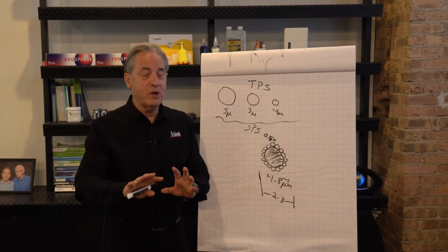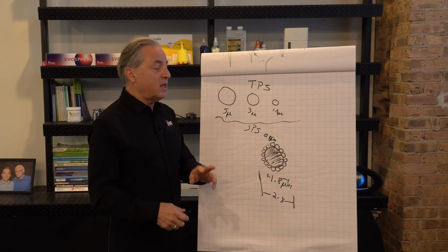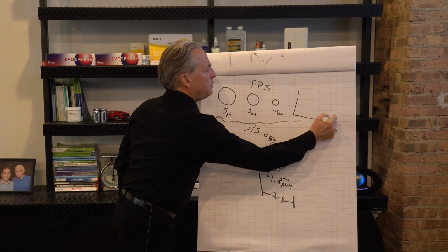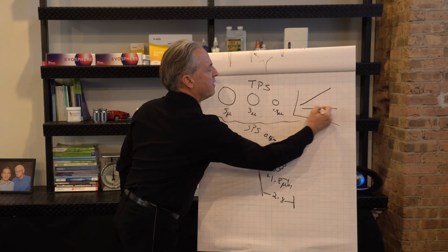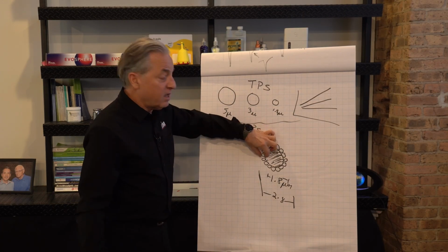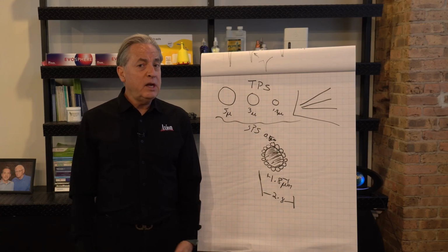Now that's the theory. So incredible efficiency and really reasonable pressures. In practice, it really does work pretty much that way. The pressures are exactly in between. In fact, we did a paper on this. We did a poster on this and presented it, I believe, at Pittsburgh Conference, where we showed the pressure of, I don't know, we'll call that the 1.8 micron. That would be the 3.5 micron, and that would be the 2.8. So it's right in between them. It's well within the pressure range of a regular instrument, and it gives you the higher efficiency of the small particles. So it is sort of the perfect world in HPLC.